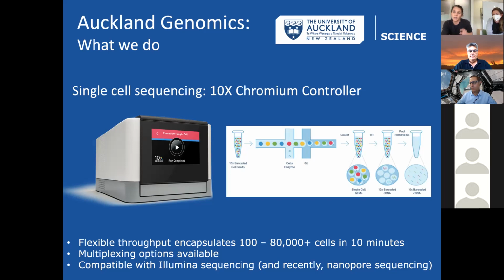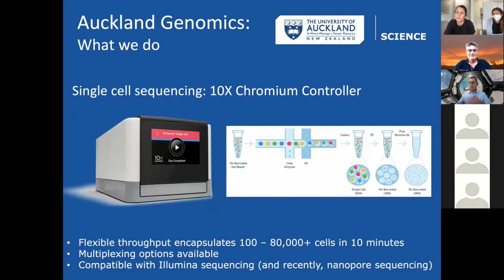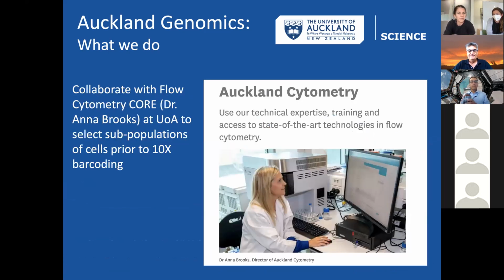Typically people do that with Illumina sequencing, but Nanopore has just come out with the ability to also do that with Nanopore sequencing. So you can get full length transcripts. That's quite new though, to be honest. So yeah, we're getting there.